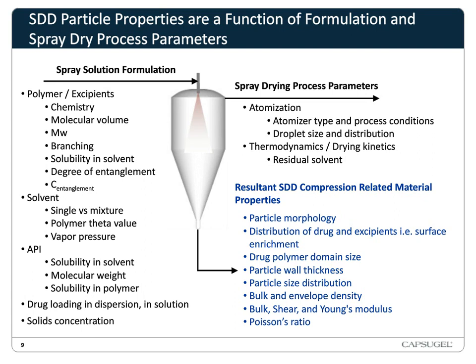SDD formulation and solvent type, although they heavily influence downstream handling of the SDD powder and the mechanical properties, are generally selected based on dissolution performance and physical stability. And therefore, this talk is going to focus more on process handles as a way to engineer a particle's mechanical properties. As we see on the upper right, the process parameters are further broken up into atomization and thermodynamics. And these are the two orthogonal handles that we use when we engineer particles.